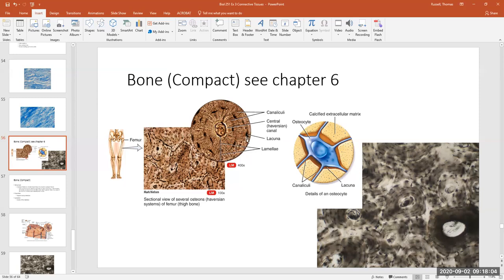Each ring is called a lamella or lamellae. The lamellae are where the lacunae are located, and inside the lacunae are the osteocytes. At the very center of this circular structure is a canal called the central canal — older name Haversian Canal. Blood vessels run in there. As soon as you see these circular structures that look like trees cut down, you know you're looking at compact bone.